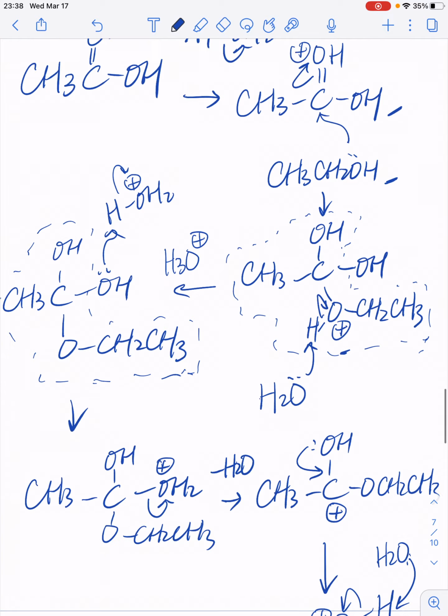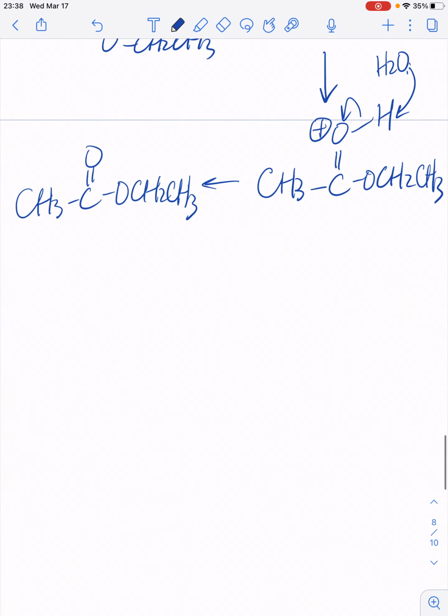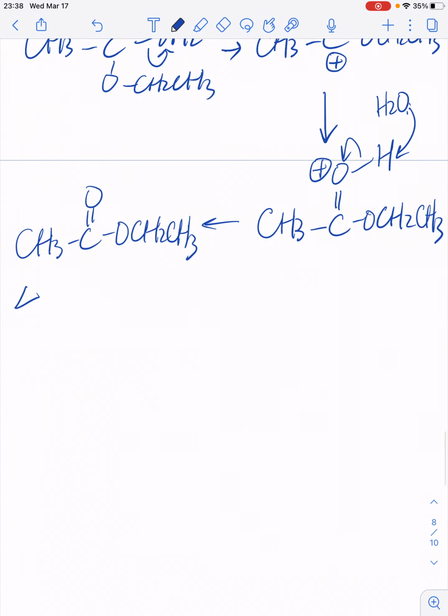Okay. And in the end, I'm not going to go over the detail, but I hope you will take a close look at the FTIR and proton NMR spectrum of the products, including analysis.